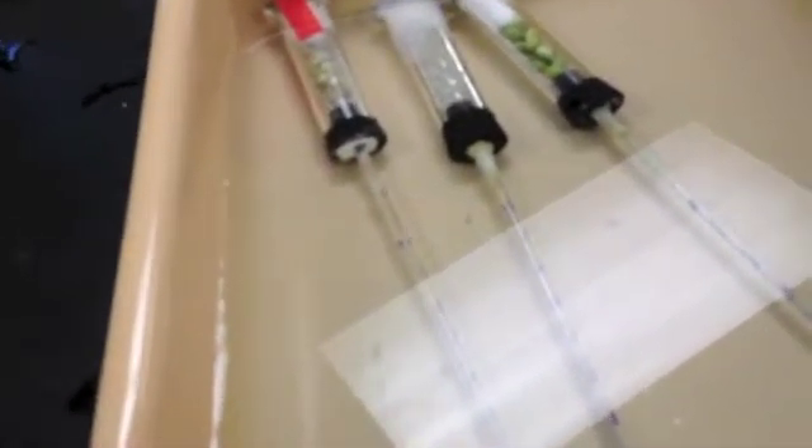The five-minute mark just passed. We measured the beads-alone pipette, which is the middle one — 0.85 milliliters, which didn't change from the initial zero minutes. For the germinating peas pipette, we have 0.75 milliliters. And then for the dry peas and beads pipette, we have 0.87 milliliters.